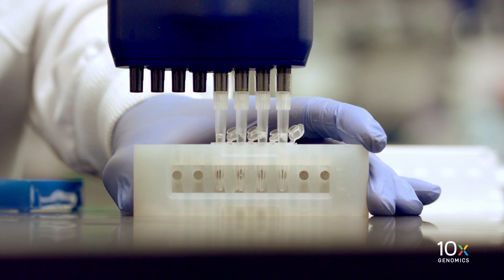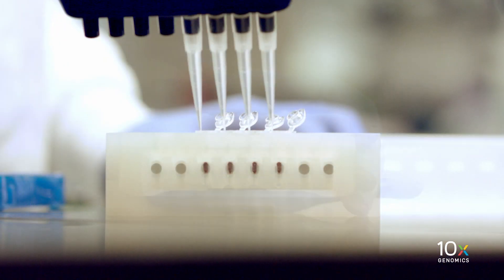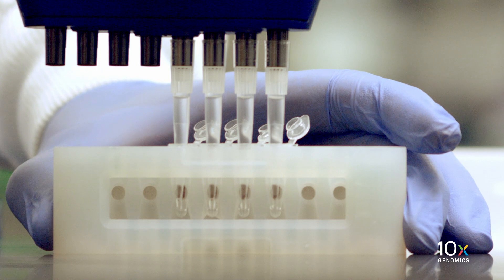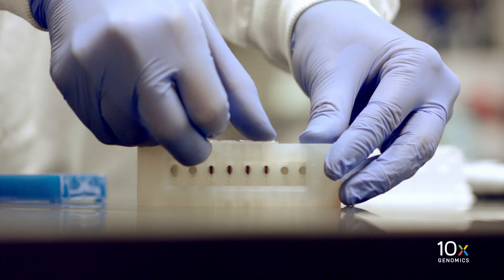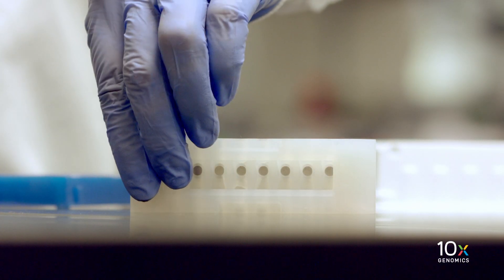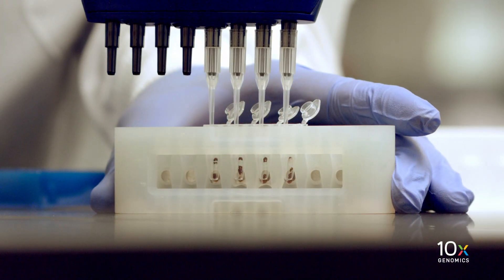Carefully remove and discard the ethanol wash. Then add 200 µL of 80% ethanol to the pellet and let stand for 30 seconds. Carefully remove and discard the ethanol wash. Centrifuge the tube strip briefly and return it to the 10x magnetic separator in the low position. Remove and discard any remaining ethanol, and allow the samples to air dry for one minute.